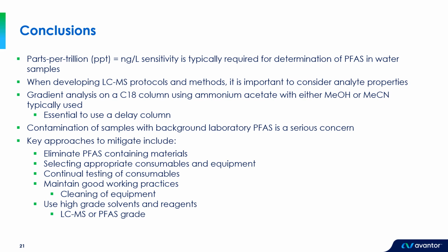And finally, just that cautionary note that if you have workflows set up that work for you but extend the range of PFAS you're looking to monitor, just be wary that there may be a degree of work necessary to remove background sources that you weren't previously aware of.